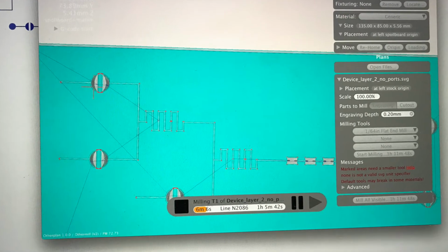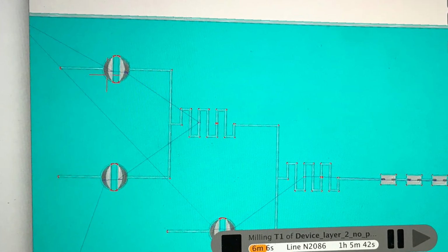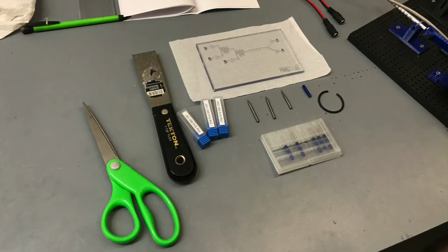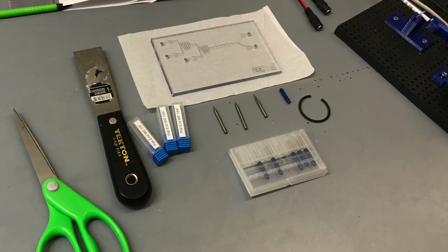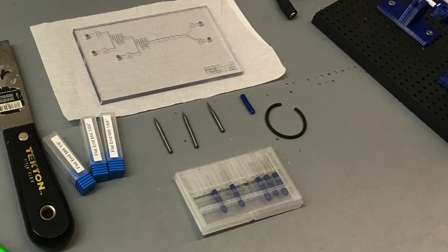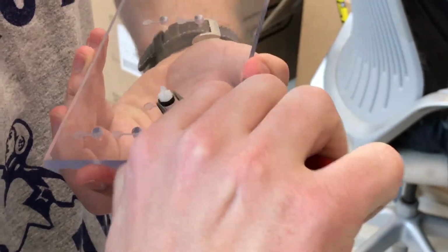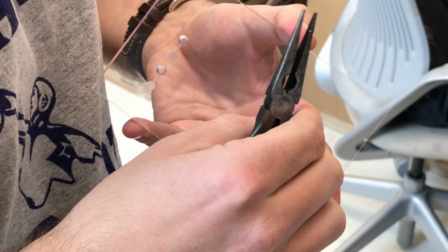Adjustments to the mixer, such as in some cases assembling directly using the channel primitive, resulted in better tool planning. There were additional challenges in milling as seen here by the various parts that had to be replaced during our iterations, namely several drill bits and a pulley on the CNC mill. With the final device ready, the connections and seals are attached so the tubing and syringes can be connected.